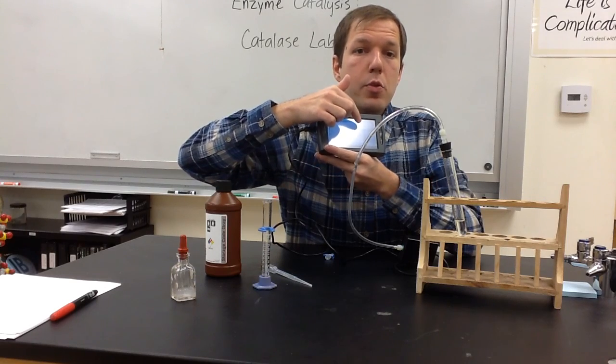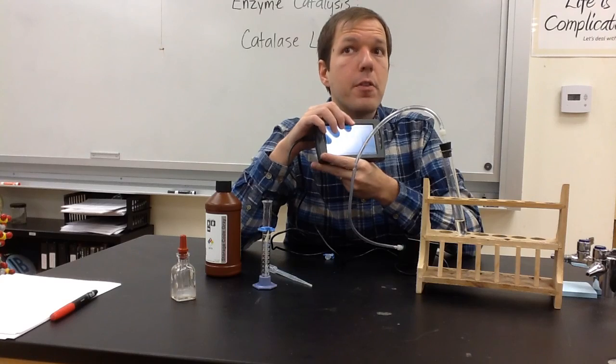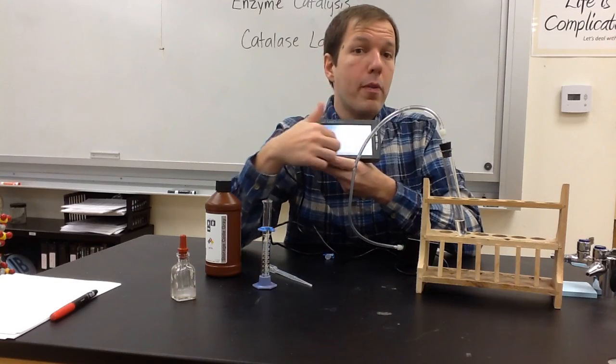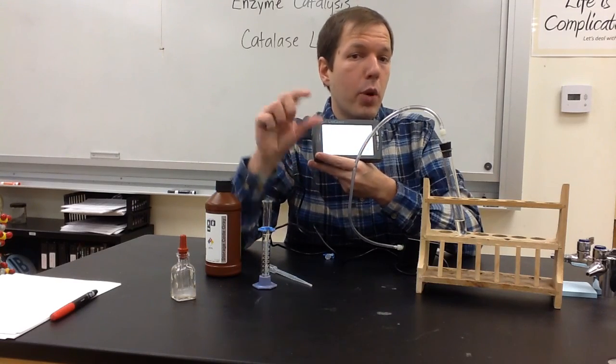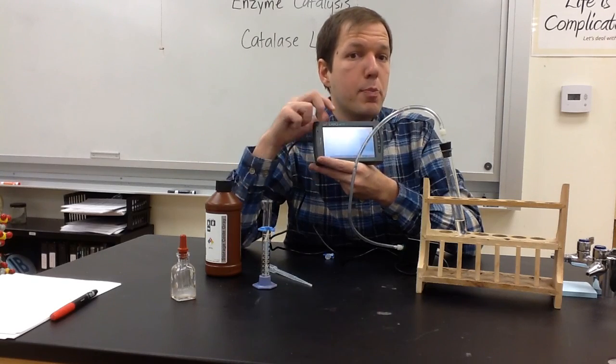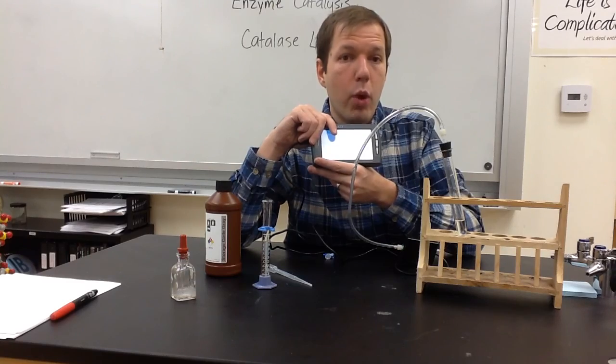So first find the linear fit that describes the slope of that line, because that slope, whatever that number is, is giving you a number of kilopascals per second. That's providing you with a rate, and that's the number that you want to use to compare one trial to another.